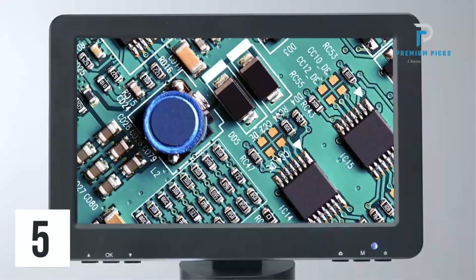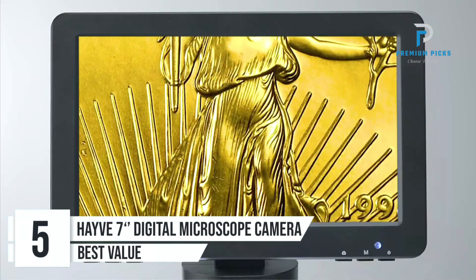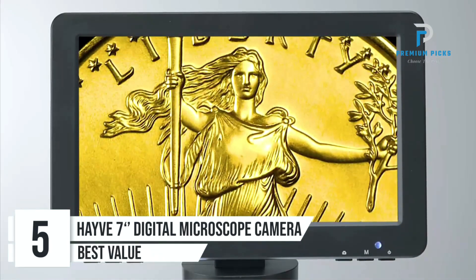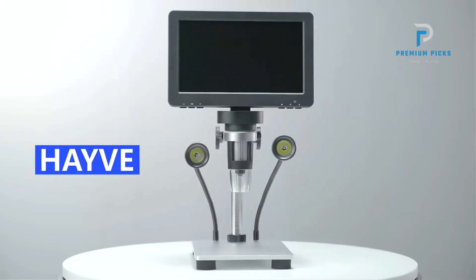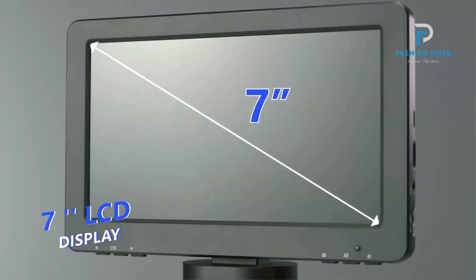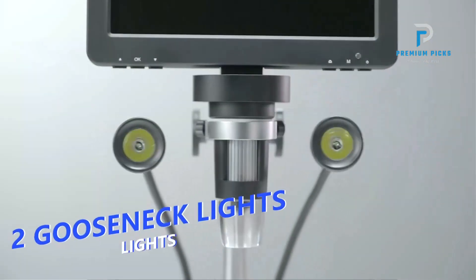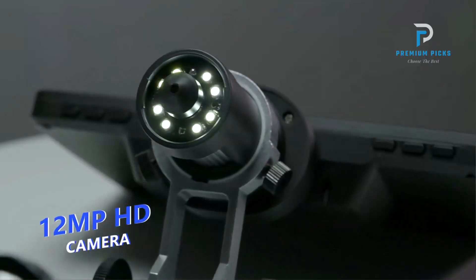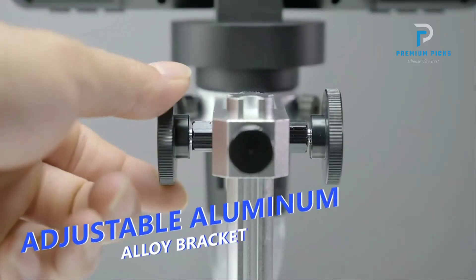Number 5: Hayve 7-Inch Digital Microscope Camera. Are you eager to explore the intricate details of the microscopic world? Look no further than the Hayve 7-Inch Digital Microscope Camera, also known as DM9, a powerful tool designed to provide unparalleled clarity and precision in your observations, with impressive specifications tailored to meet the demands of professionals and enthusiasts alike.